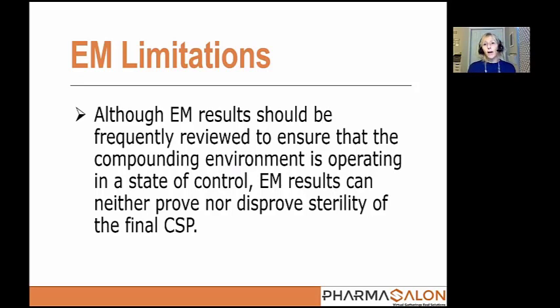And I've seen environmental monitoring data used to say, oh, we recovered bugs, product's not going to be any good. And that's not really true. More goes into it than just saying, okay, microorganisms were recovered, we have to trash all of this. There's going to have to be some understanding of what else goes on with that environment and what other quality systems are in place.